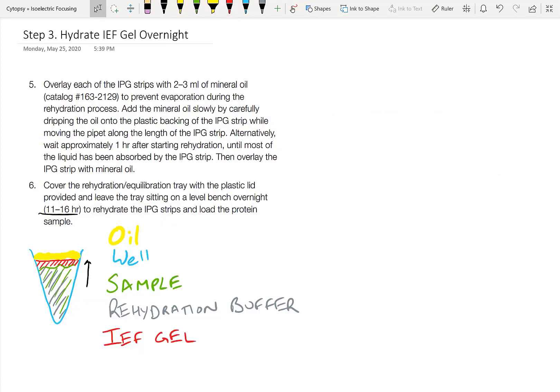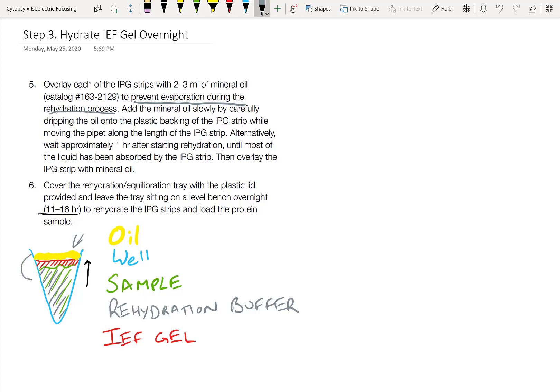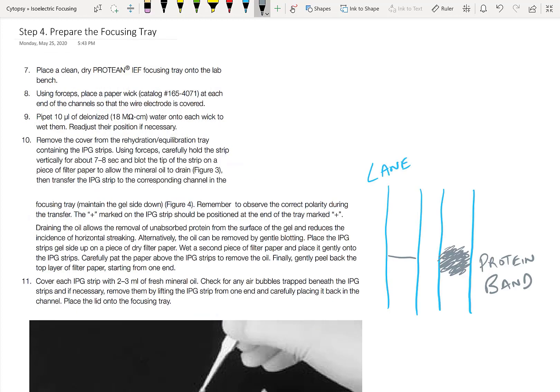Our next set of steps is to add some mineral oil on top of the IEF gel just to make sure that we prevent any evaporation during the rehydration process. Just a little bit should be plenty. Make sure that the oil doesn't actually spill into the sample. That won't be that great. They also give you this nice alternative of just waiting maybe about an hour before adding that oil on top. That should help prevent mixing with the sample. And then after that, all you have to do is incubate overnight on the bench.